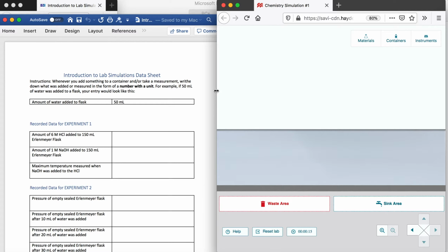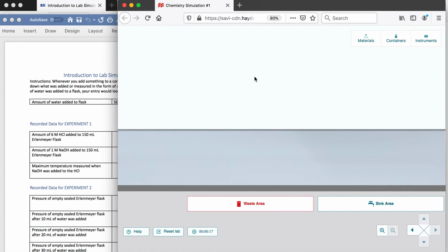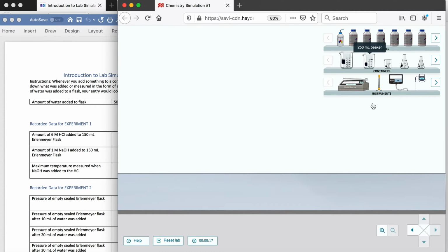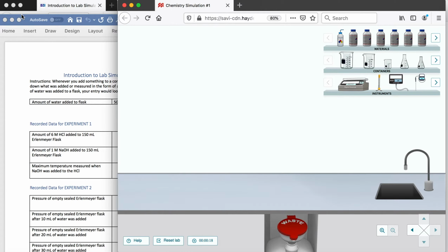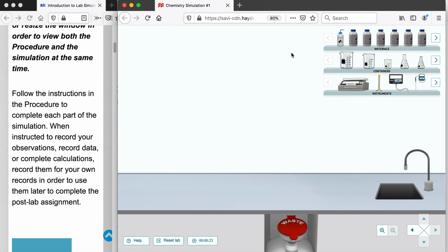Come back to that in a second. I'll move this over here like this, and now as you can see these all appear as pictures, which makes it a little bit easier, although you can do it the other way as well. So there you go, there's all your materials. Now if you click on the actual window, make that live, you'll be able to mouse over these things.